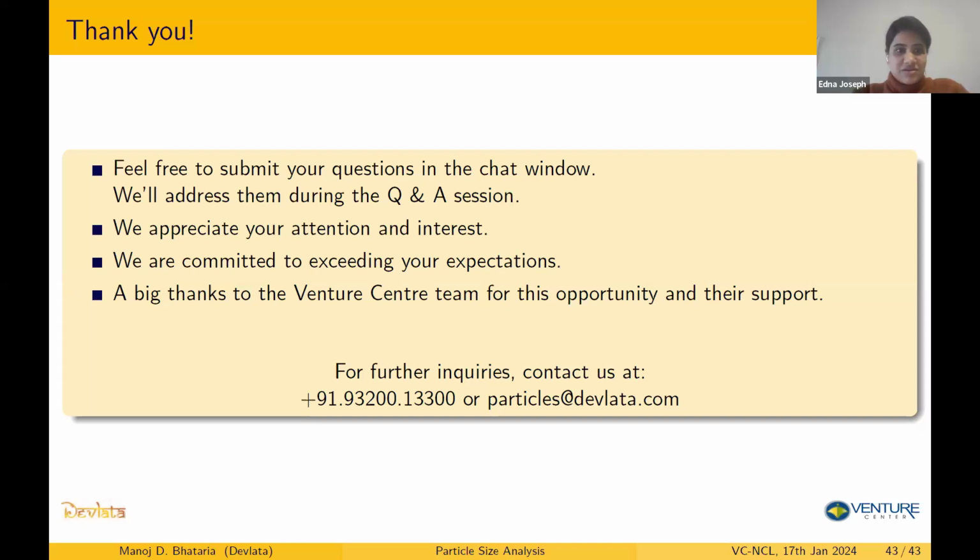Sure. So I hope, Amit, your query has been clarified. Moving to the next question, it's from Rohini, and she says, how to choose the angle in DLS analysis. Can you just repeat? How to choose the angle in DLS analysis.